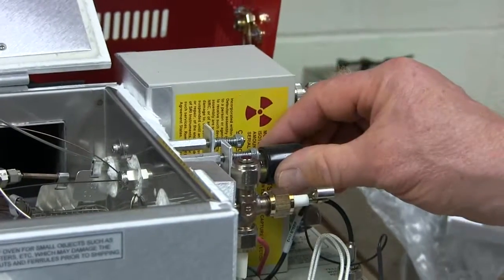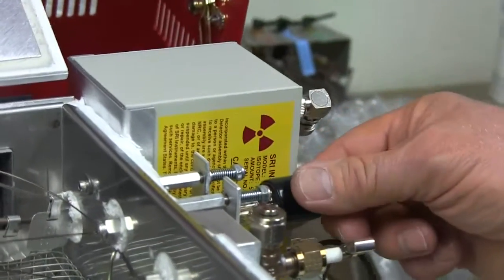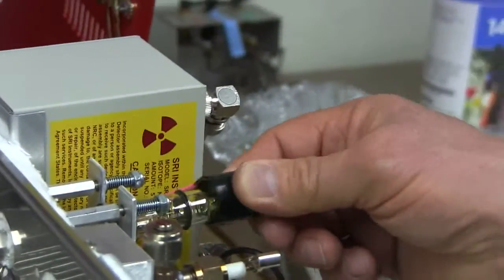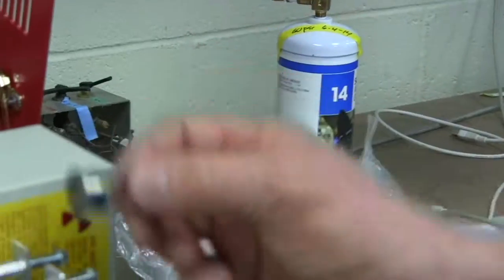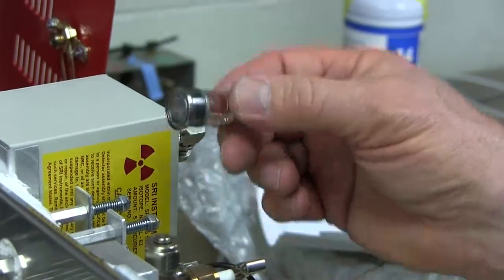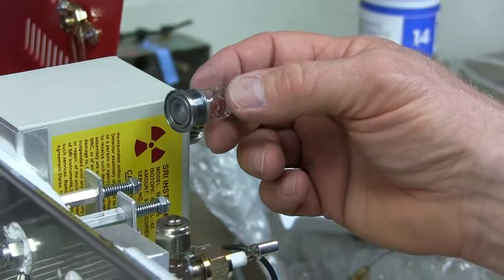This is the photoionization detector, which we abbreviate as PID. This particular detector has a light bulb called a PID lamp, and the light from the PID lamp is what ionizes the molecules and creates the signal.